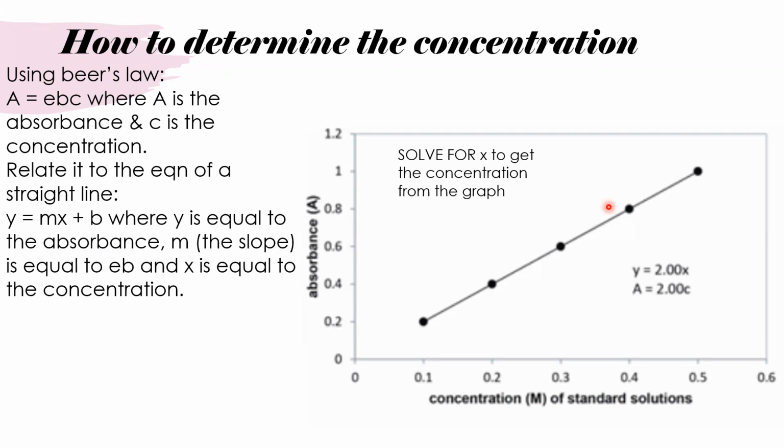So the absorbance of each standard sample at the maximum absorbance is measured and then plotted as a function of concentration. Okay, and then the plot of data should be linear. Assuming a linear standard curve is obtained, the equation that provides the best linear fit to the data is generated. So you're just going to get a function for a straight line, y equals mx plus b.